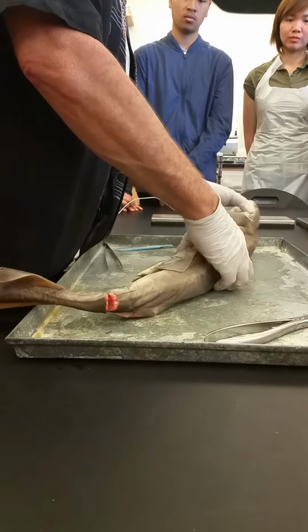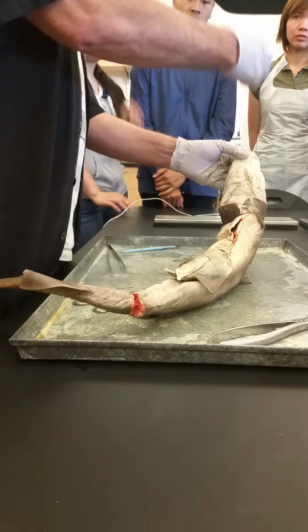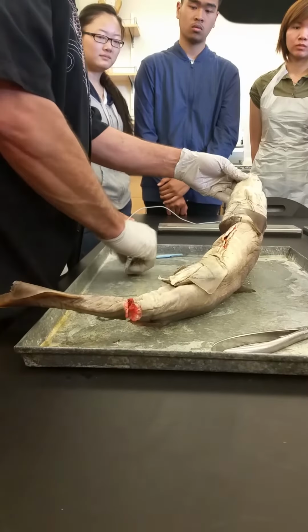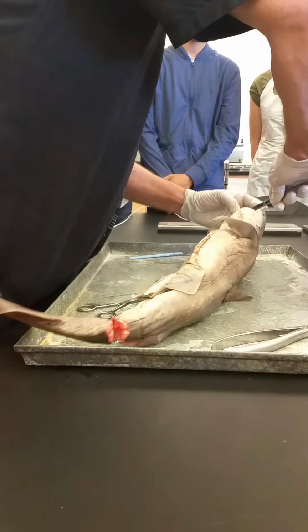And that actually continues in their jaw. In their jaw, instead of having one row of teeth embedded in their jaw like a bony fish does, or like you do, they actually have multiple rows, get probe in here, of teeth in their jaws.